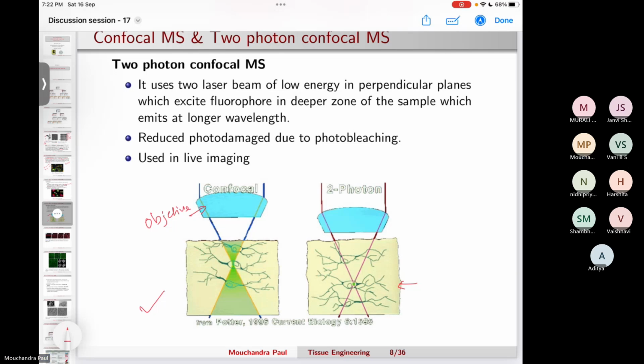Okay, so confocal microscopy, you can use it with samples which are fixed on glass slides, or you can use it directly on live cells, like the cells you observe under the confocal microscope and then keep in the incubator for further culture. Okay, so various modifications are available today that can be utilized as per your need.